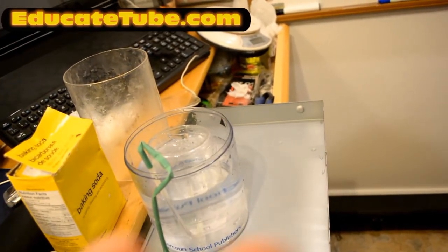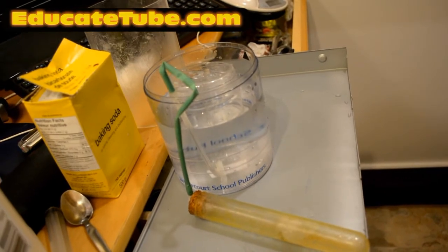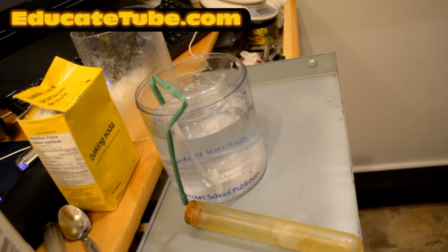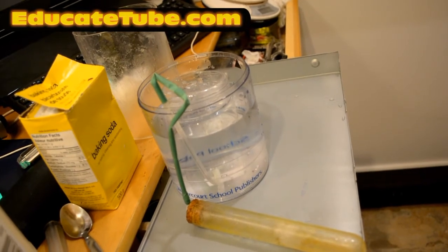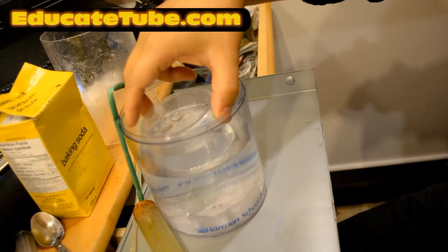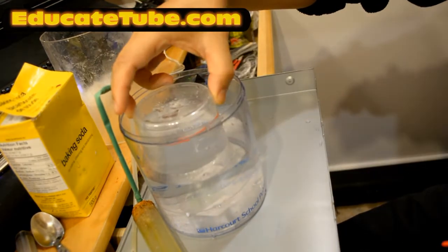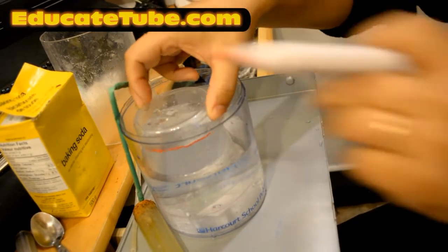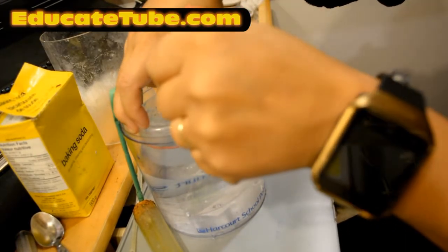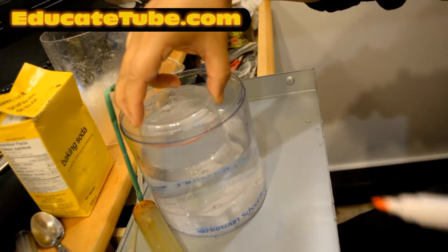You can see that. There's the bubble right there. So it's still bubbling. You can see it bubbling up. Let's see how much volume it displaces, how much gas is produced. Okay, so here we see, there we go. This line is pushed out and the gas is in here, it's carbon dioxide gas. And draw a line to represent the gas displaced.